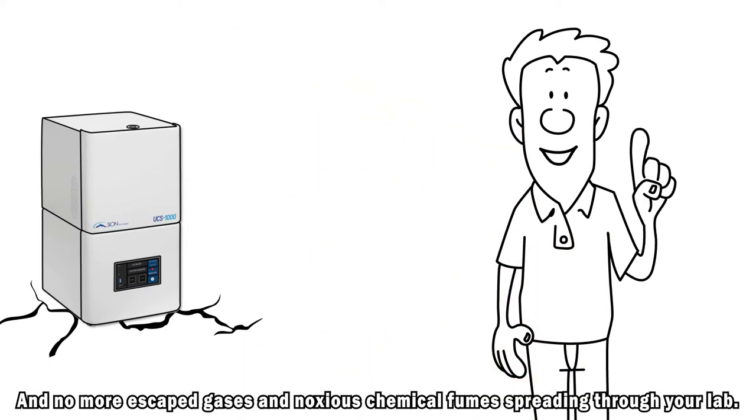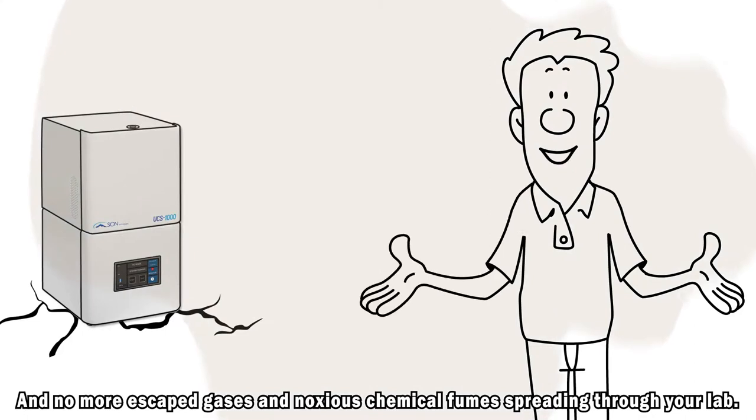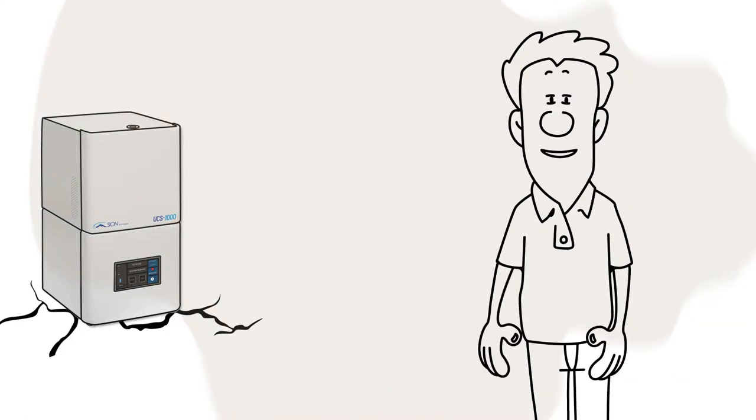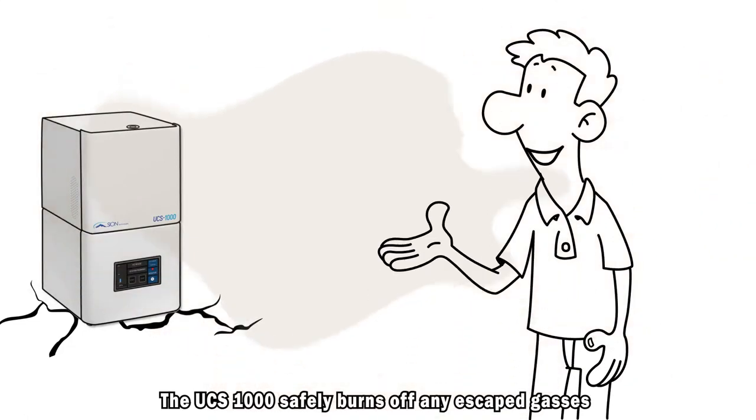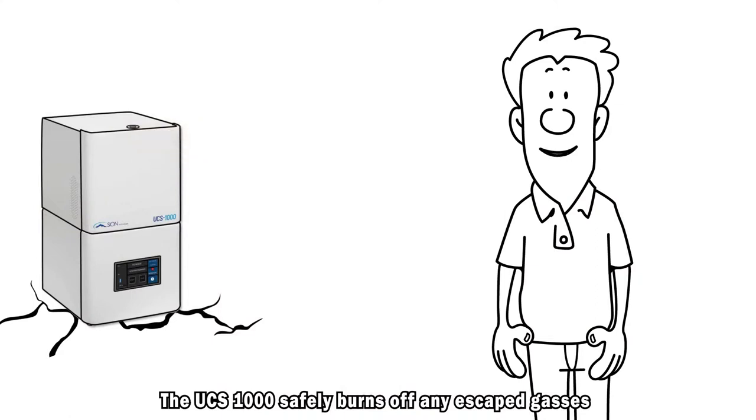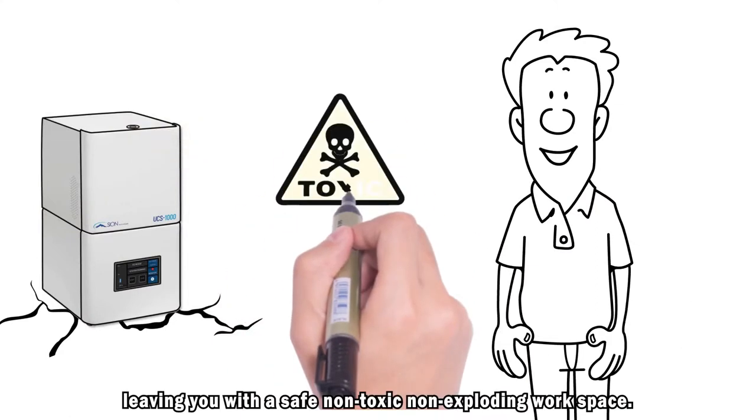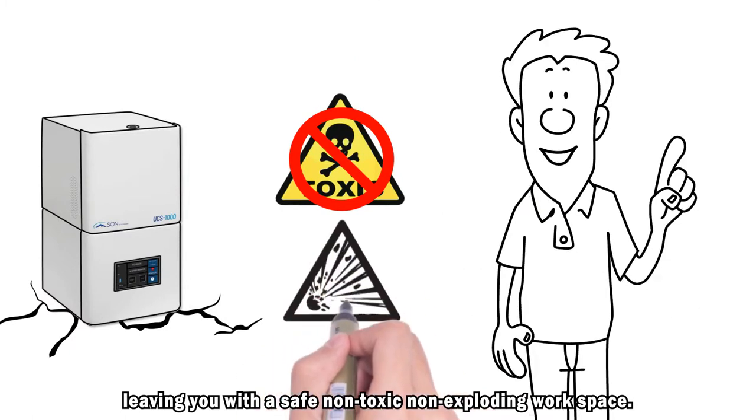And no more escaped gases and noxious chemical fumes spreading through your lab. The UCS-1000 safely burns off any escaped gases and turns them into water vapor and CO2, leaving you with a safe, non-toxic, non-exploding workspace.